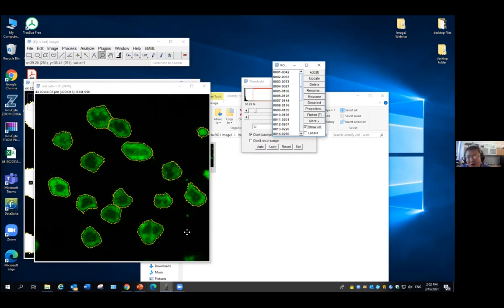Our goal is to use the same protocol, the same treatment, on all the images. Then we can compare the difference between different conditions. So always try multiple images, play around, and then find one protocol that gives reasonable results on most of the images. Then I fix this protocol and go through all my images.